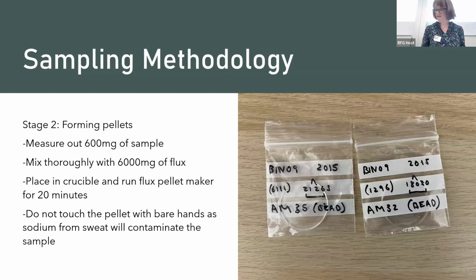Whilst adding flux arguably dilutes the sample, the pellets are used exclusively for XRF, which is designed to detect major elements, whereas the undiluted powder is used for ICP, which is best suited for detecting trace elements, and therefore the concentration is considerably less of an issue. So, by combining these two techniques, we can extract the optimum amount of information about the elemental composition, which is further augmented by the sample treatment process.